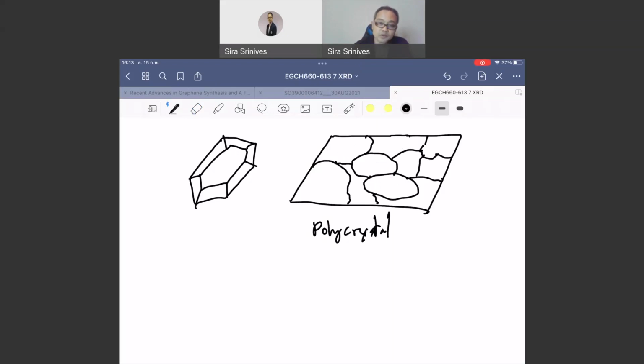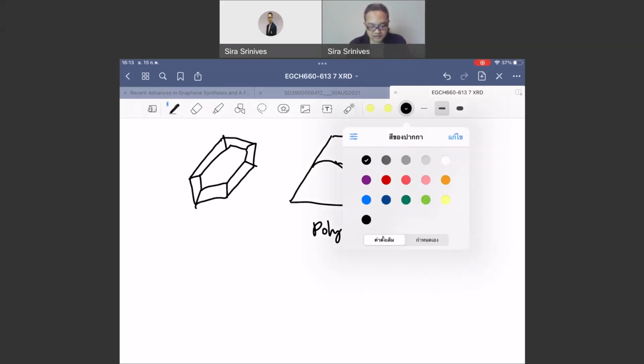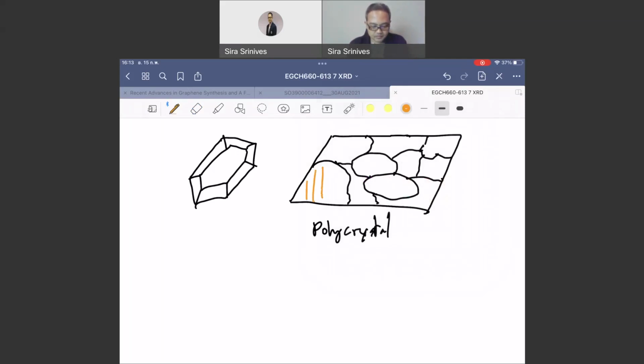Just like when we study the light diffraction pattern, a polycrystal that has a big grain size means each and every crystal is big. So in one material, it wouldn't have so many crystals. The whole thing is pretty close to a single crystal, right?